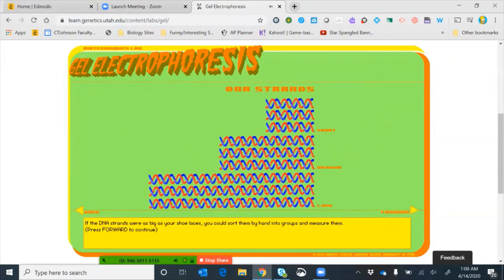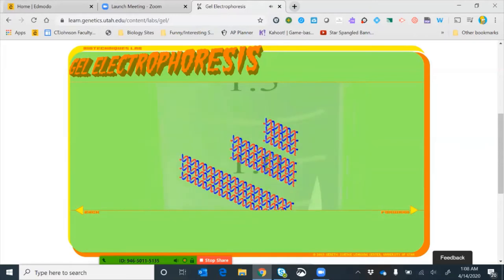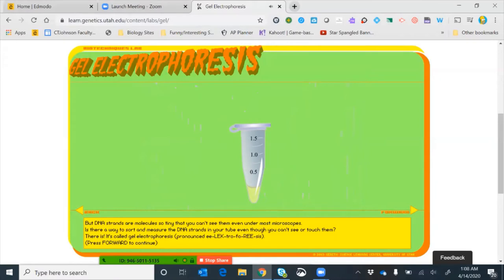Notice the prompt: if DNA strands were as big as your shoelaces you could sort them by hand, but of course they're microscopic. Some could be really small, some medium, some really big. We want to separate them by size — that's what gel electrophoresis does. DNA strands are molecules so tiny you can't see them under most microscopes; you'd need an electron microscope. But there is a way to sort and measure DNA strands in our tube: gel electrophoresis separates fragments of DNA by size.